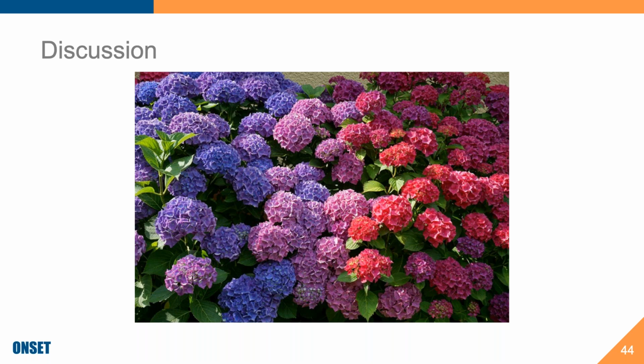If you do store it dry, yes, there is a concern that the electrolyte inside would get dry, and salty. So usually, a person that is going to use a pH electrode stored dry will have a pH electrode that has a removable cap for the internal electrolyte, and then you take out that internal electrolyte, rinse it with some distilled water to rinse it all out, and then you store the electrode dry.